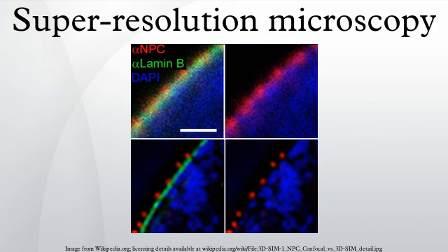The Vertico SMI microscope achieves this in the following manner: the illumination intensity within the object range is not uniform, unlike conventional wide-field fluorescence microscopes, but is spatially modulated in a precise manner by the use of one or two opposing interfering laser beams along the axis. The object is moved in high-precision steps through the wavefield, or the wavefield itself is moved relative to the object by phase shift. This results in an improved axial size and distance resolution.